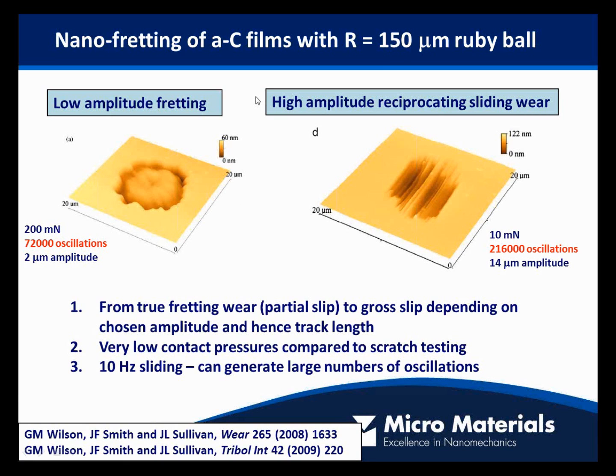Under different conditions, in this case they've gone for lower load and much higher track lengths, or higher amplitude, and they're getting a transition to a sort of grooving wear. So you're getting a transition from partial slip to gross slip. The key point about these is that you can run them under very low contact pressures compared to conventional nano-scratch testing, so it allows you to access part of the tribological behaviour.